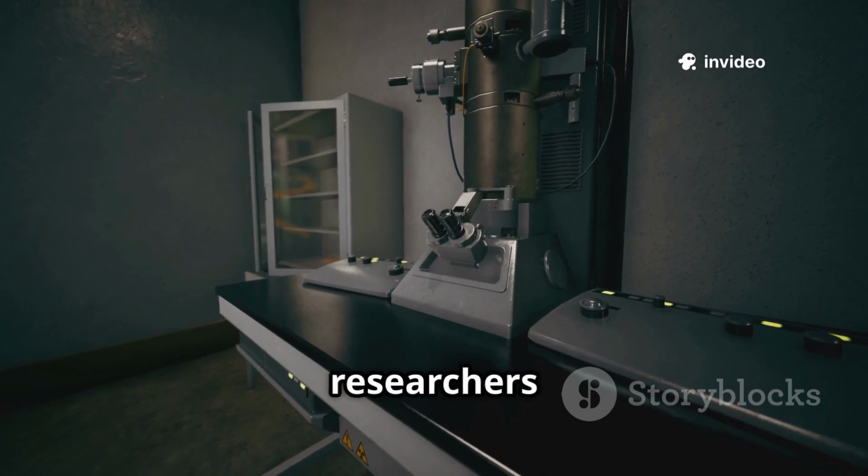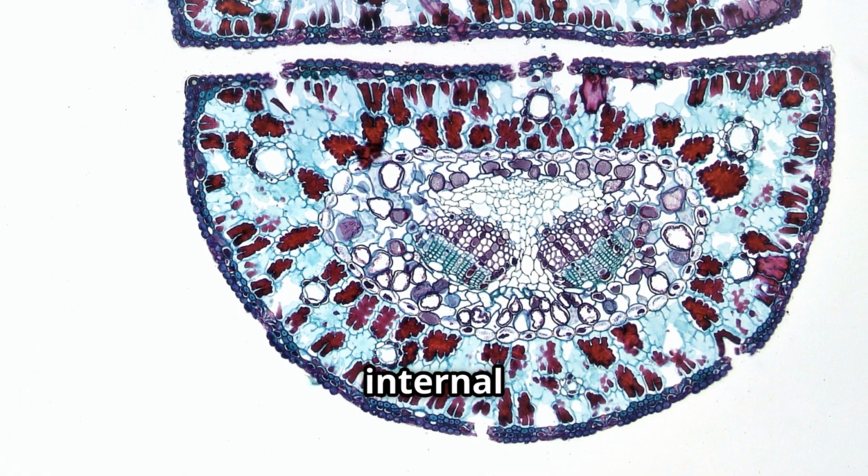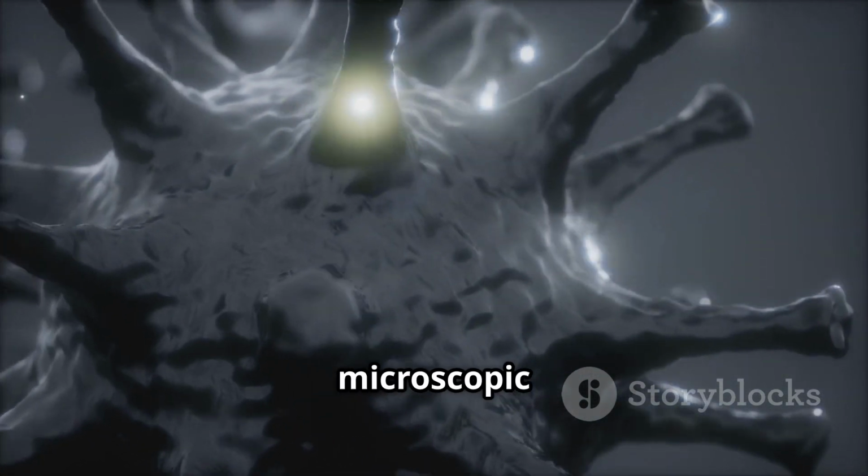This control lets researchers tailor the SEM to their needs, revealing surface textures or internal features. The result: stunning, detailed images of the microscopic world.